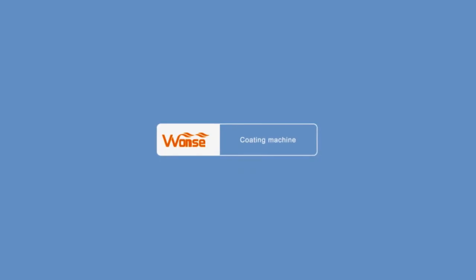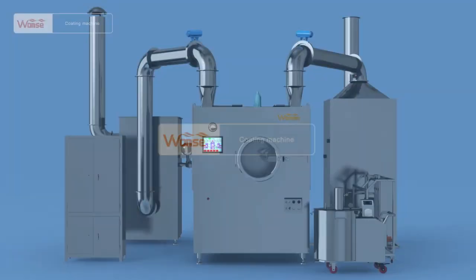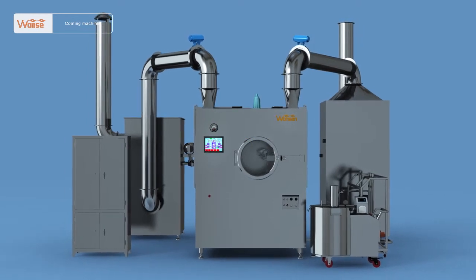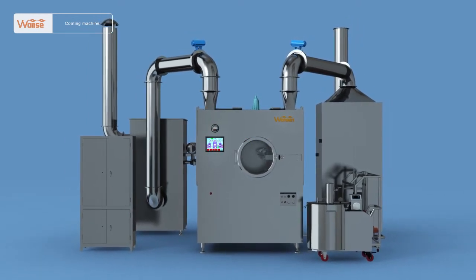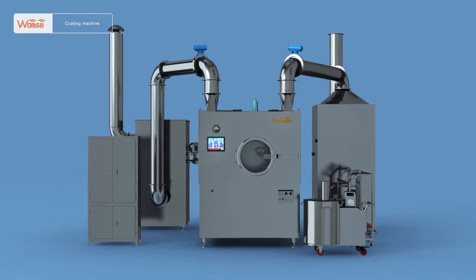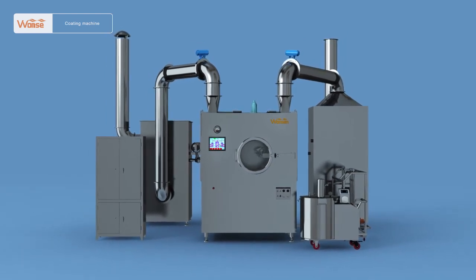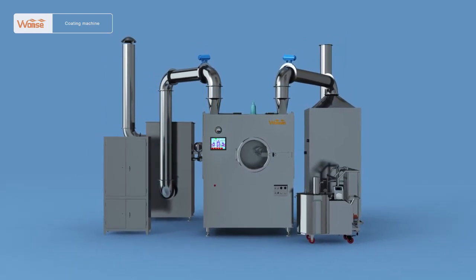The BGB high-efficiency coating machine is a special machine used for sugar coating, water-based film coating, and organic film coating of traditional Chinese medicine and Western medicine tablets and pills.